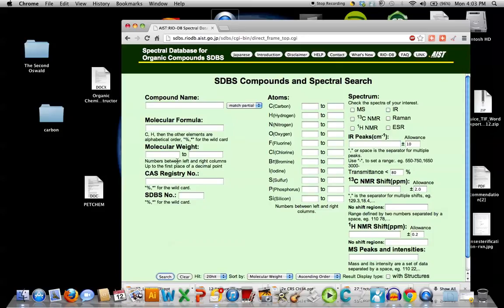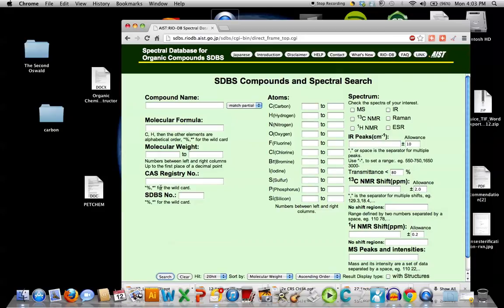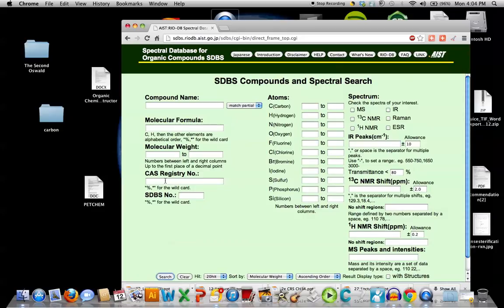Or even molecular weight. You can type in, I would like to know what you have in the database from molecular weight 16 grams per mole up to 100 or 100 to 120. If you know the chemical abstract registry number, every compound has a registry number. New compounds are assigned numbers. If you go to the chemical abstracts, bound volumes in Hanley Library here on campus, or if you go online with a librarian's help, you can type in a registry number and find out the name or the structure. So if you have that number, you can put it in as well.